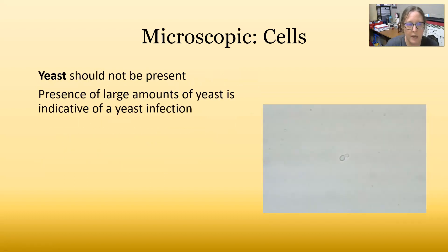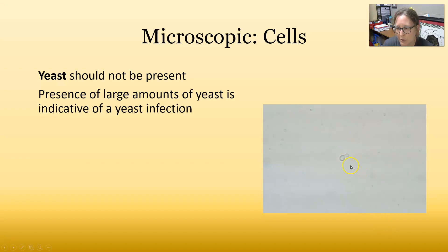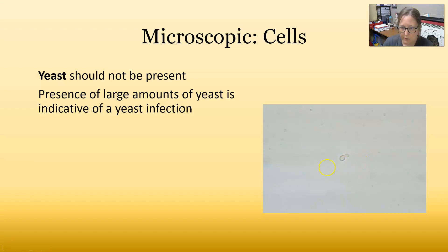This picture represents bacteria — you can see these little dots scattered all over; those are bacteria. Yeast should not be present. The presence of large amounts of yeast, or really any yeast, is indicative of a yeast infection usually coming from the genital tract. You can see they are attached and budding. It can be hard to distinguish yeast from a red cell; it takes a trained eye. One key difference is that yeast bud whereas red cells do not.